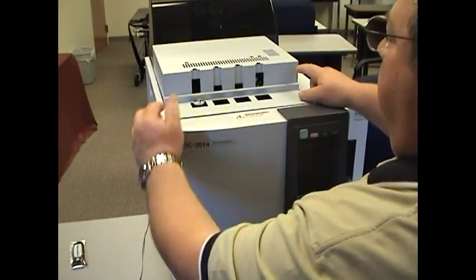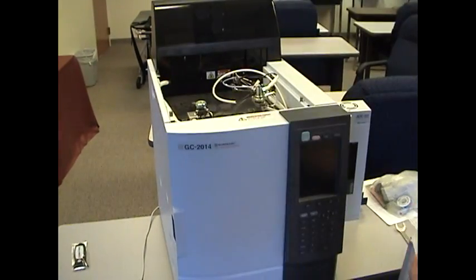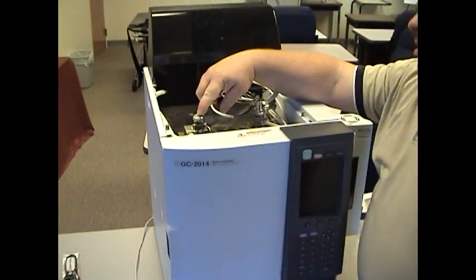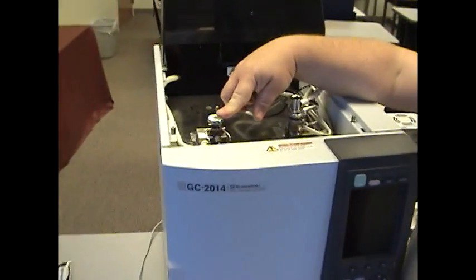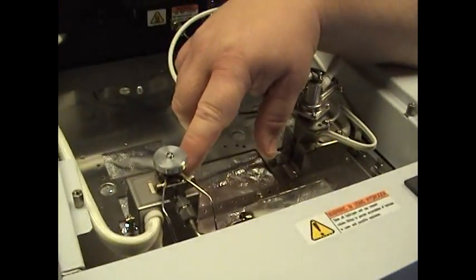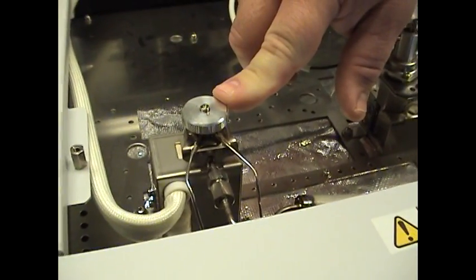Next thing we do, remove the lid, and that will expose the top of the GC. Right here is where the port is, the injection port. Contained in here will be your SEPTA and your injection liner. Make sure this is cool before you begin any kind of work.